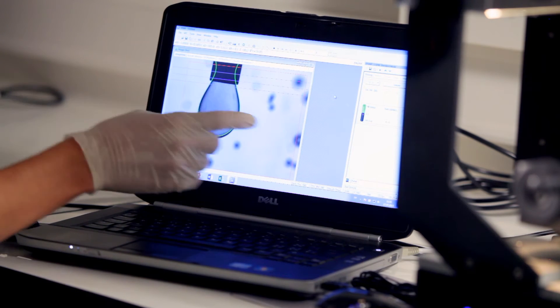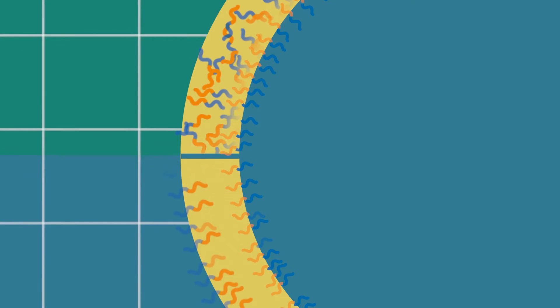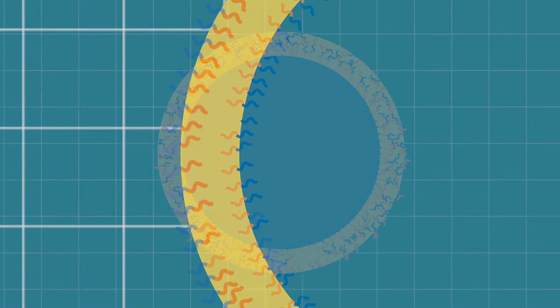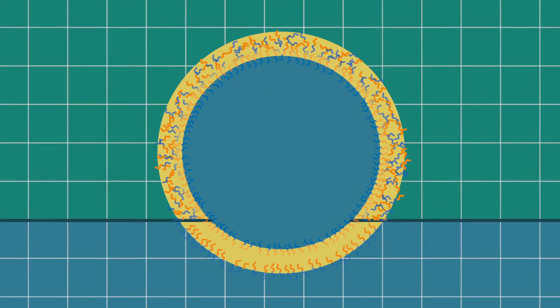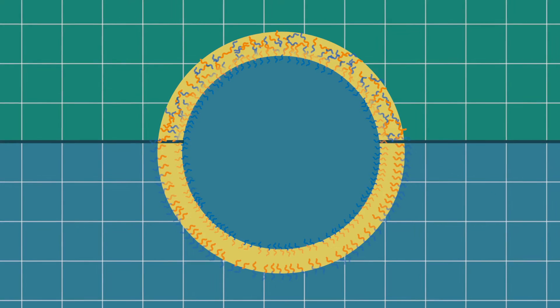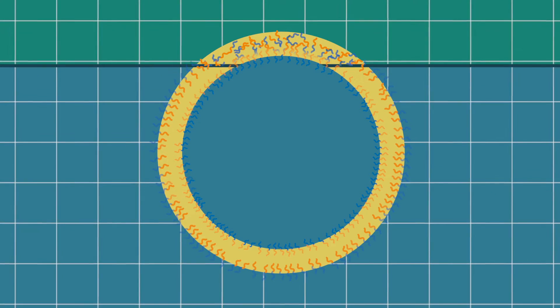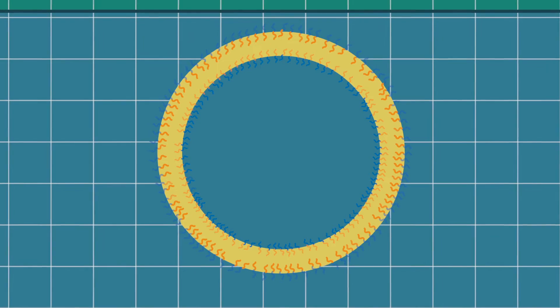When I make this drop bigger the molecules really like the water so they will go to the water but they need the oil. These molecules are going to stay on the surface of the drop, one part of the structure in the oil, another in the water. Once they have taken up the full interface of oil and water the microcapsule is formed.